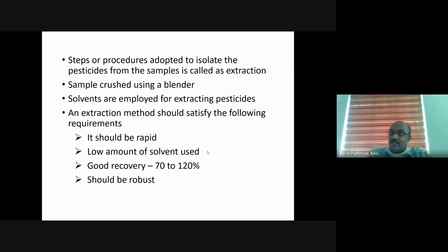And here comes the next thing: we can also detect 1.2 ppm. That is also permissible. Here it may be a bit confusing for you. You added only 1 ppm of pesticide and you understood that it is up to 0.7 ppm. Yes, there can be a loss of 0.3 ppm, and minimum we should detect 0.7 ppm. And how come we detect 1.2 ppm, that is 120 percent?